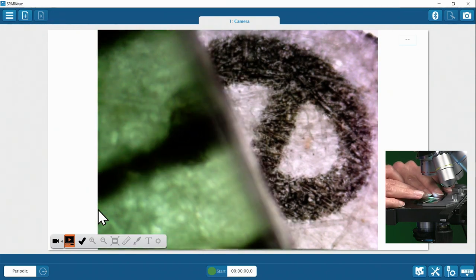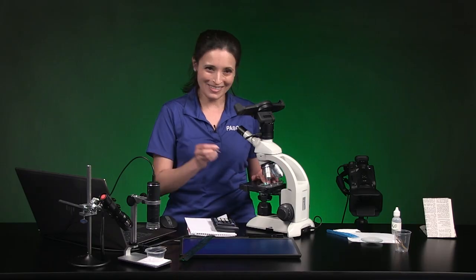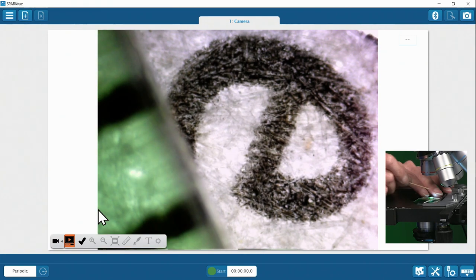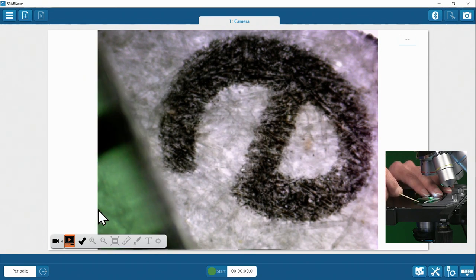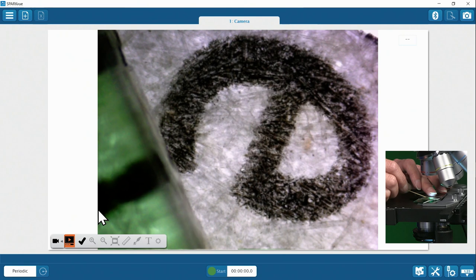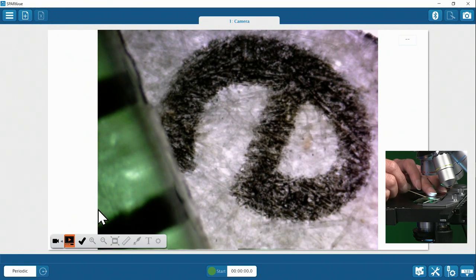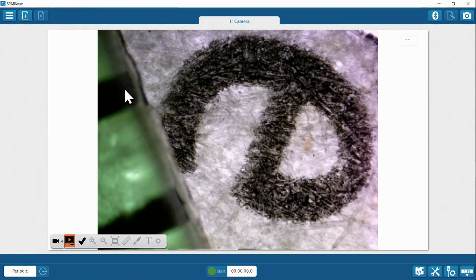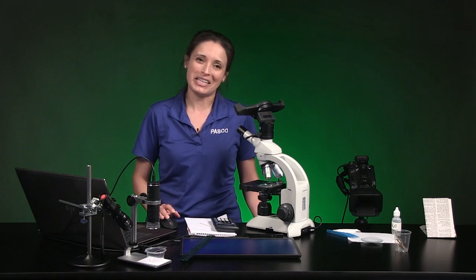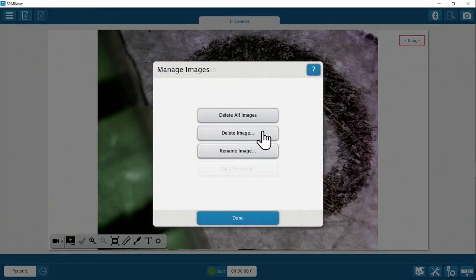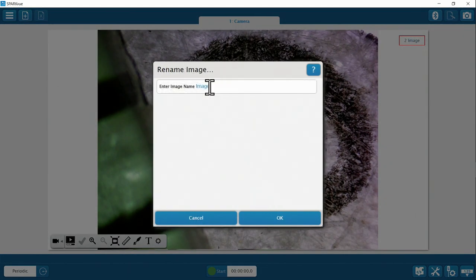Be patient with this part — you may need to reposition or refocus. A toothpick comes in handy here to nudge the ruler chunk where you want it. Now I've got two distinct ruler lines that are visible enough to calibrate with — I can see enough of them to work with, so I'm good to take my snapshot. I'll rename this image 'calibration' and save my work.